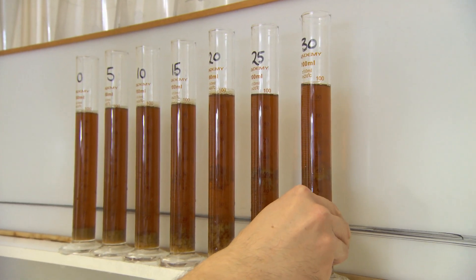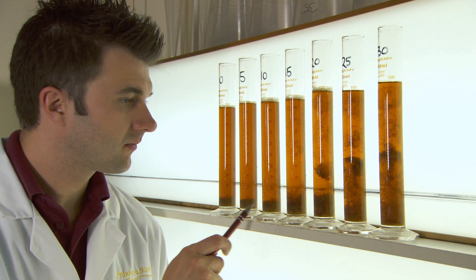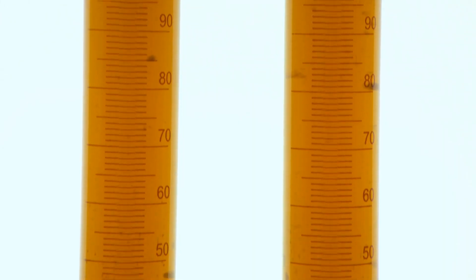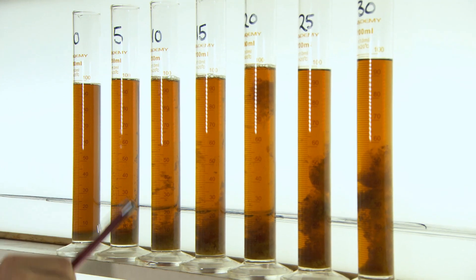Now let the samples stand for a full 24 hours, then you can assess them. Bear in mind that whilst adding more finings will improve clarity, it will also increase the level of sediment. You're looking for that balance between a bright clear wort with the lowest haze and as compact a sediment as possible. Take a note of the solution rate that gives you the best sample.